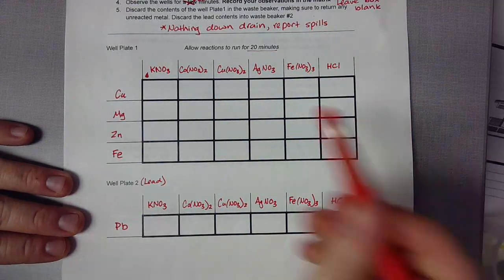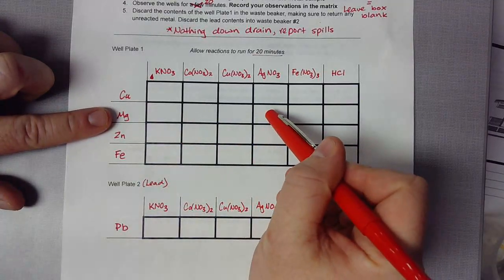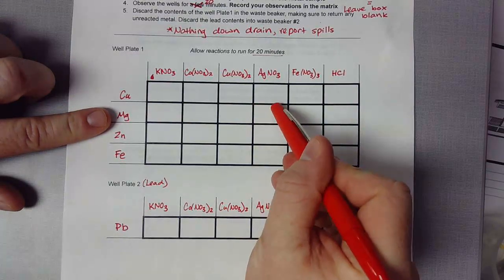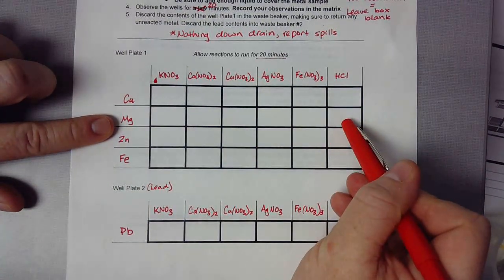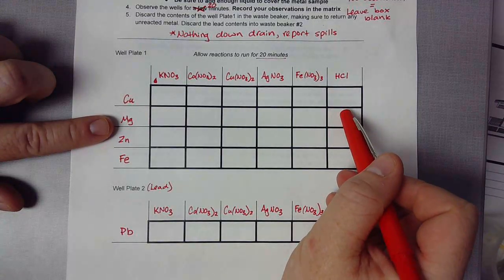Record what you see. So this is not going to be a true one, but if magnesium, when it mixes with AgNO3, silver nitrate, turns hot pink, write hot pink in the cell. If magnesium, when it mixes with hydrochloric acid, you see no visible change, put nothing down in that cell.